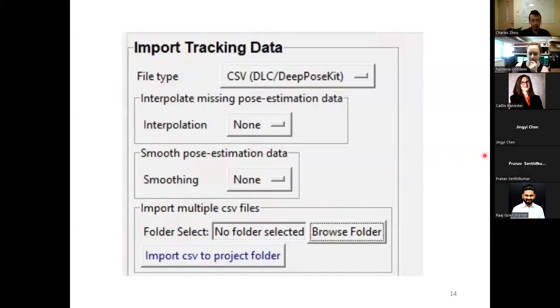Yeah, that's where the process of adding new frames that you're sure about, and then outlier correction, comes in. When you say, I don't know exactly where the mouse's nose is, but I know it's definitely not where DeepLabCut put the dot, moving it closer can be really helpful for getting it working. I see. Thanks.